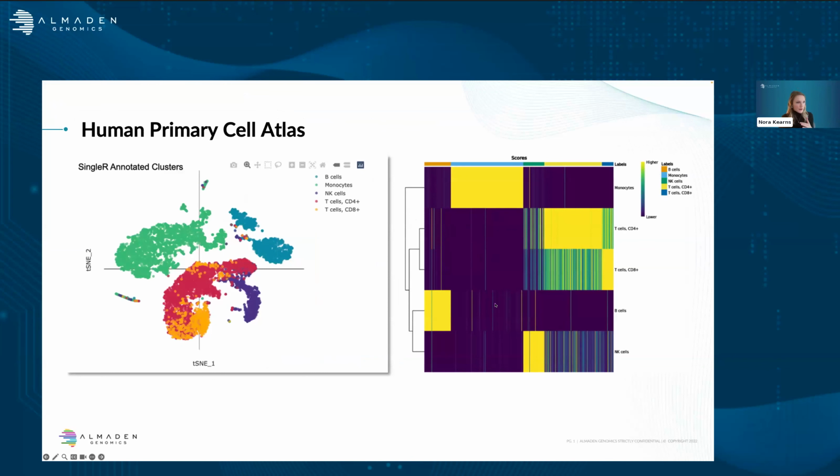So when we're performing cell type annotation, we want you to think of running analysis of single cell genomics as being very similar to running an experiment at the bench. So you may get to the point of clustering of your cells and you see that those clusters are not really what you'd expect. They're not clustering well. So there's a lot of things that you can adjust, and that's totally normal and accepted. It's not like you are fudging the data at all.